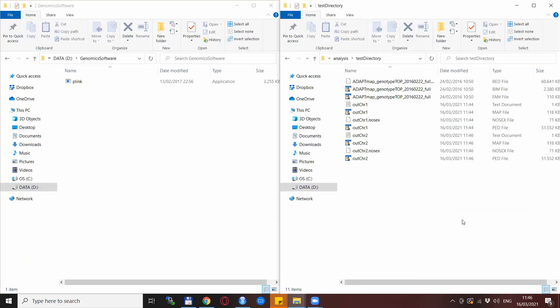So just back to the test directory, you see chromosome 2 is extracted without Plink being actually in this directory. So with the same logic, you can use just one single Plink executable file throughout your entire computer and simplifying your life with using Plink just a little bit.